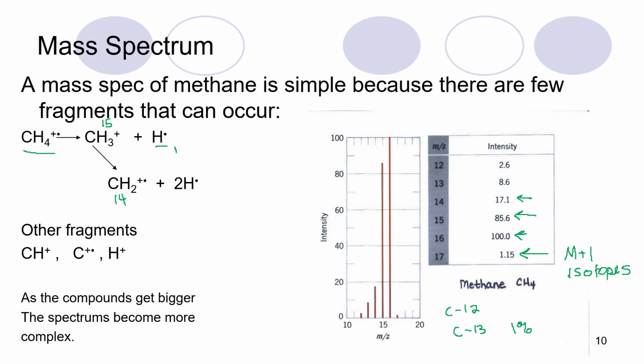Sometimes it gives an indication of how many carbons are in your chain, but for what we're doing, I don't think you really need to. You can pretty much ignore it, but don't let it confuse you, and don't automatically look for the highest peak. So in this case, the M+ peak is the 16, and the M+1 peak will be the isotope peak. And so you don't want to confuse that. When we do some problems, I'll try to make it really clear which is the M plus peak, and then you can look for the other peaks. You'll see actually very much later on an isotope peak called the M plus 2 peak can be very useful. So we'll talk about that in a little while.